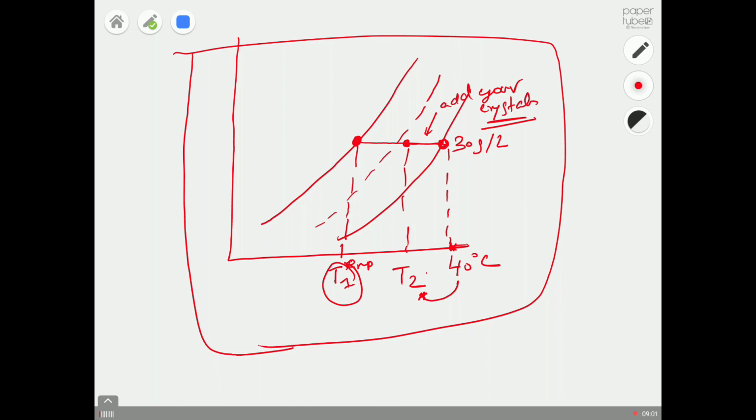I know it's going very slow, but at least you will understand what crystallization is all about, and how to pick the best process conditions where you can grow some crystals. And soon I will tell you why we need to grow crystals, and when we need to go for nucleation. These are the things you must learn and you must understand.